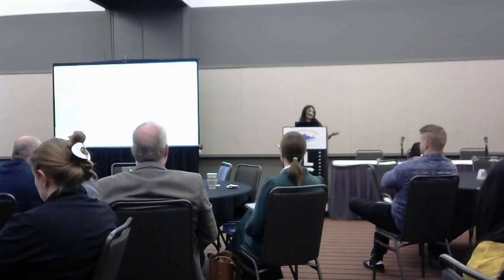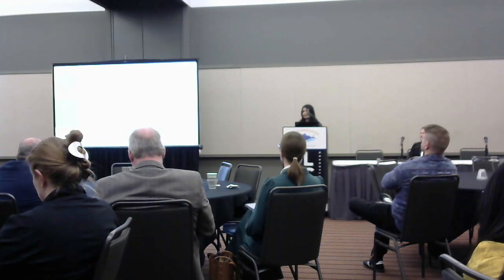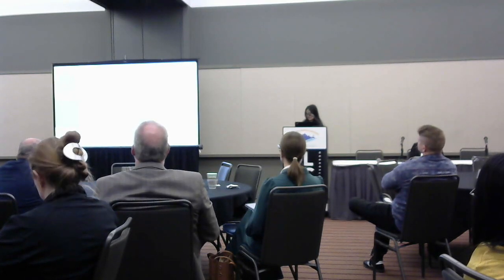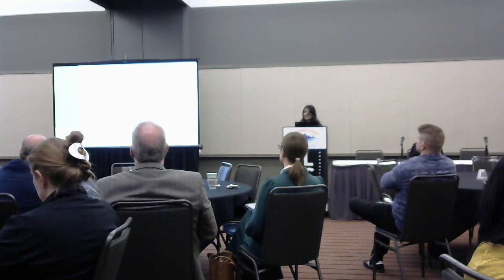Now that you have seen this comparison, the next logical question would be, can I do my analysis on the Sasquatch? And like any other microscopy question, the answer to that also is, it depends. It depends on the workflow that you're doing, because there are some workflows which are suitable for HPC, and there are some that are not so suitable as well.